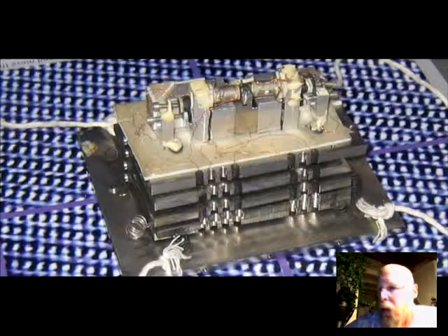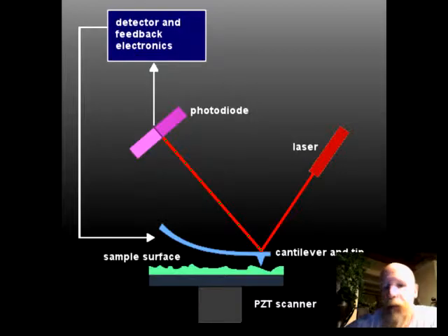So I'm going to get a little more into detail about how the AFM works. Today, most AFMs use a laser beam deflection system introduced by Meyer and Amer, where a laser is reflected from the back of the reflective AFM cantilever and onto a position-sensitive detector. Angular displacement of the cantilever results in one photodiode collecting more light than the other photodiode, producing an output signal which is proportional to the deflection of the cantilever. It detects cantilever deflections. A long beam path amplifies changes in beam angle.